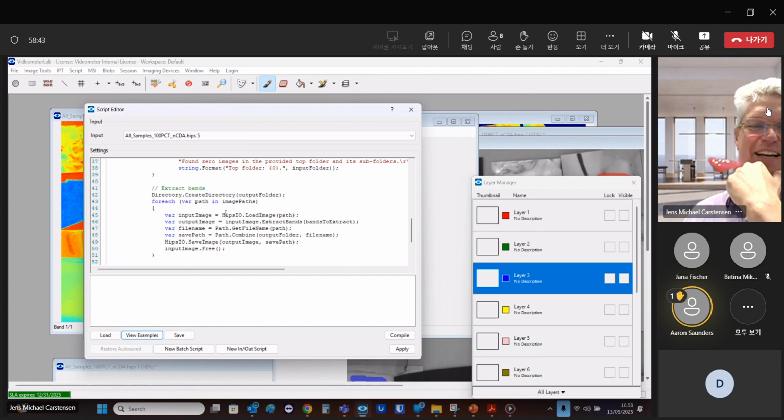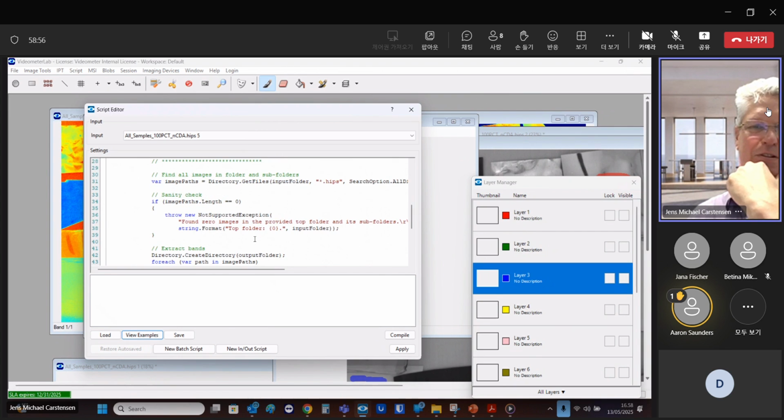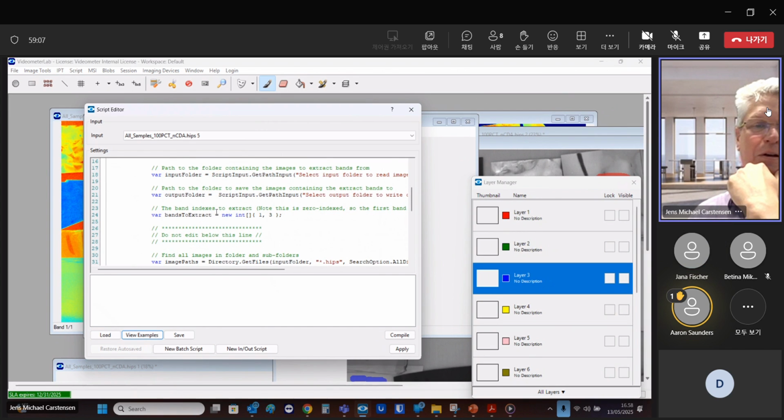It's not very difficult for C# programmers to twist and tweak this, but it turned out that people didn't like to do it anyway. So we had very few customers daring to change the C#, but you can use them as is. So that's something that is possible. But we realized that this is maybe a too nerdy type of functionality, but maybe still useful for some people.